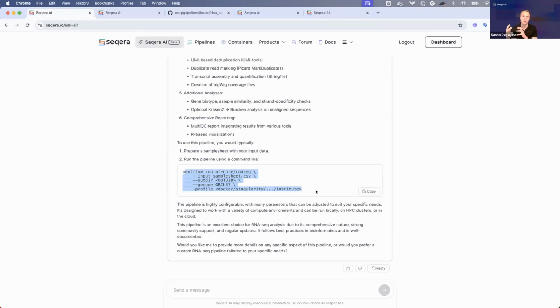So this is the number one difference between us and generic chat applications that you guys might see out there. Now, the second use case that I wanted to highlight is essentially letting you know that we're a great AI service for folks that are, I would say, Nextflow curious.